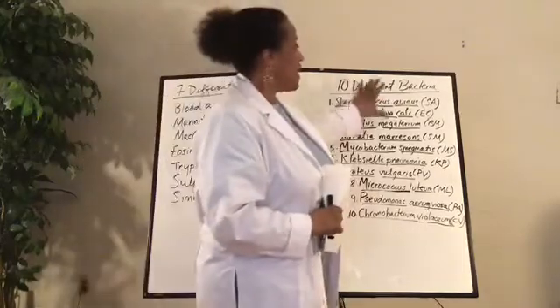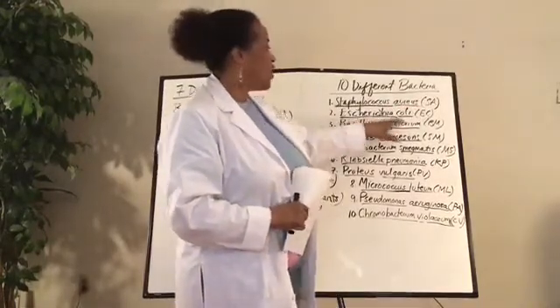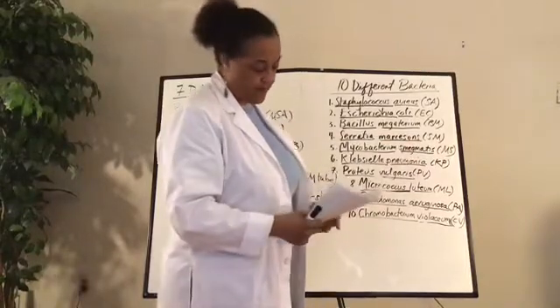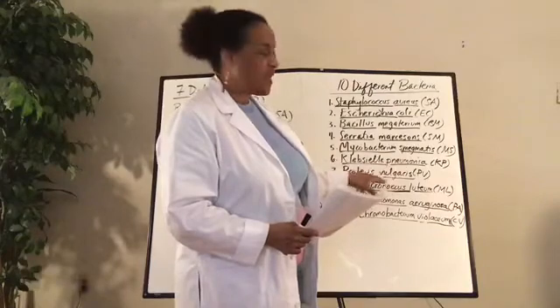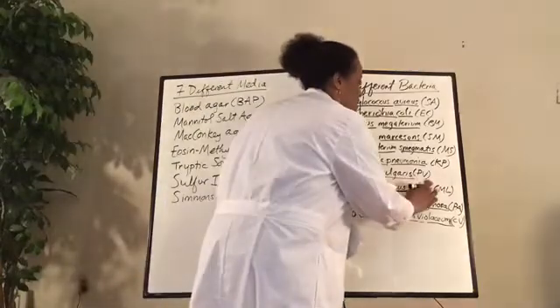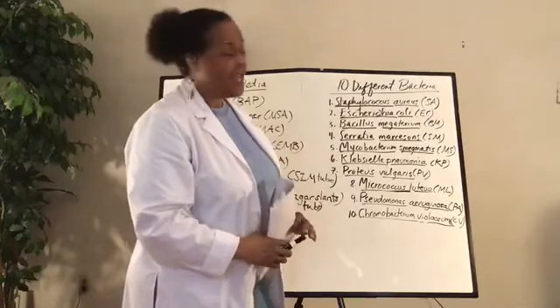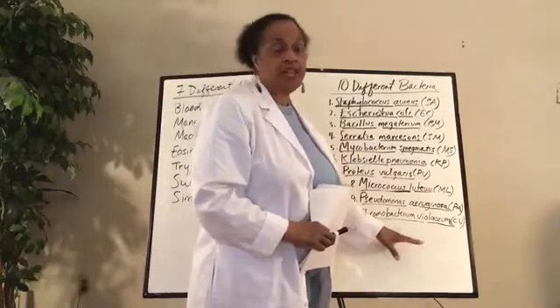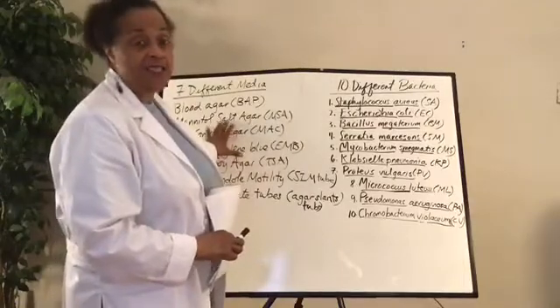Now the bacteria we're going to be using are these. You're familiar with all these bacteria already. Staphylococcus aureus, SA, Escherichia coli, EC, Bacillus megaterium, BM, Serratia marcescens, SM, Mycobacterium smegmatis, MS, Klebsiella pneumoniae, KP, Proteus vulgaris, PV, Micrococcus luteus, ML, Pseudomonas aeruginosa, PA, and then the one we didn't use that much, but you do remember that it has this purple or violet color, hence the name Chromobacterium violaceum, CV. These are the 10 bacteria that we will use to inoculate all of these different agars.